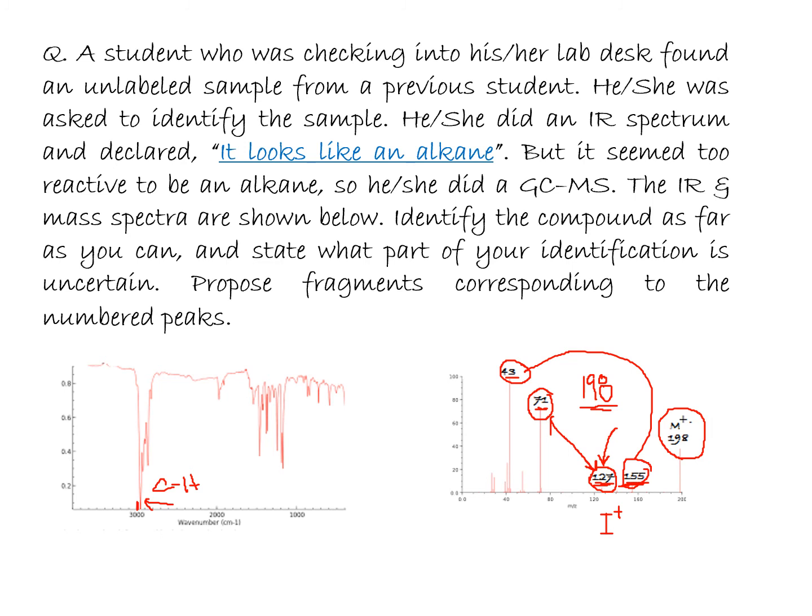So it's most likely that you have an RI, alkyl iodide.